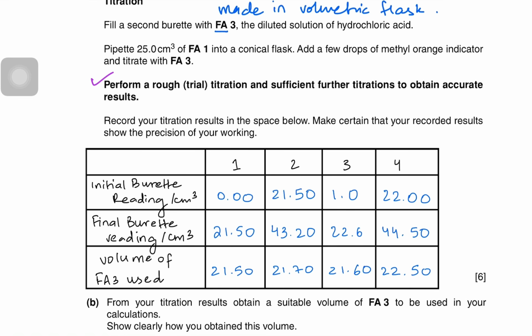The first error I can see is there is no unit used in the third row. So you have to use units every time. The second error which I can see is here and here 2 dps are not used, which is again something that you will be penalized for and you will lose your marks here. Let's identify what the student has done and whether it will gain the marks or not.